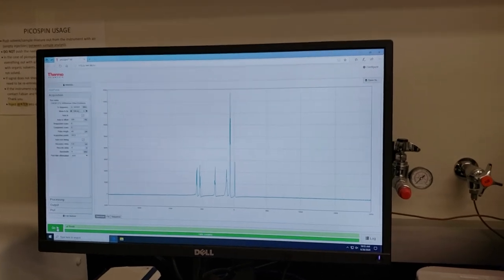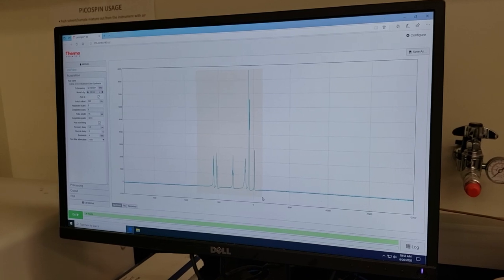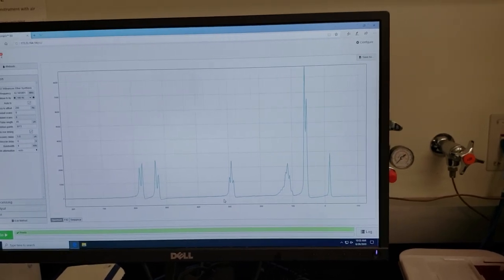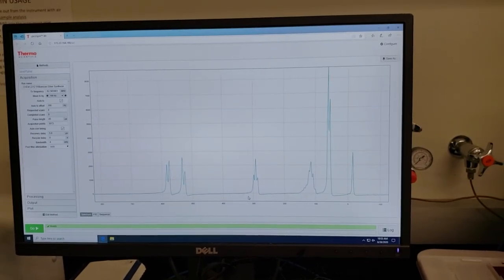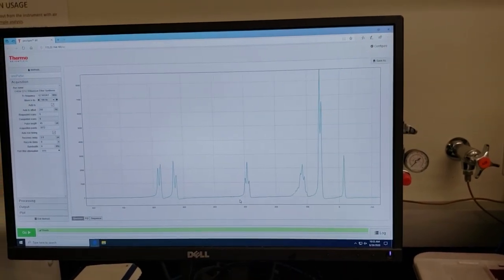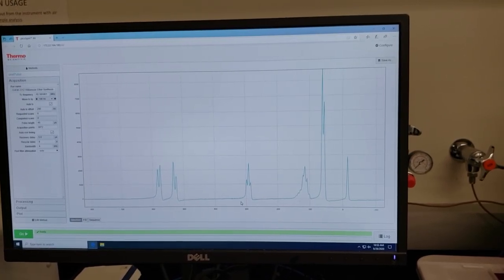And we're complete. So I'll go ahead and zoom in on the part of the spectra that is most important to us, where our peaks are located. We see that we've got some phasing issues here. We're going to correct that within MNova, the software that we're going to use to analyze these peaks. We're going to set our TMS peak to zero. It's fairly close, but we'll go ahead and set it to zero officially in MNova. That will give us all the necessary delta values that you recognize from your lecture class.